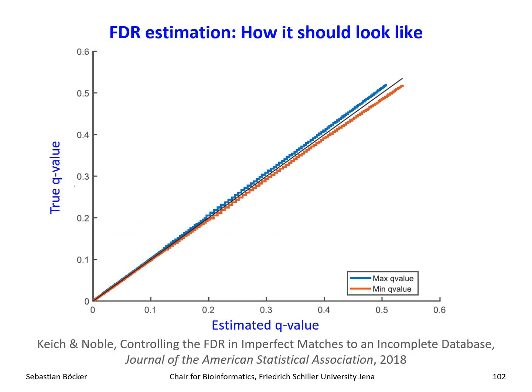Now this plot is just to show you how such a plot should look in the end if everything goes according to plan. That's from proteomics, so it has no connection to what we are doing, but you see the estimates and the true line here. This is true Q value versus estimated Q value. I told you Q value is better than FDR. Let's not go into the details, but true and estimated Q value are very, very close to each other, particularly in this highly important range between 0 and 0.1.